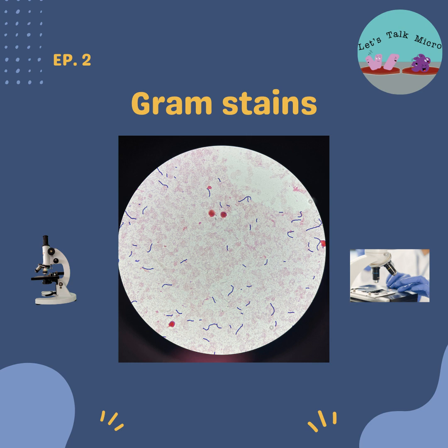And of course, as we continue making more episodes and talking more about micro, I will continue to talk about agar. But now let's go to this week's episode, gram stains. At this point in time, we all know our agar. Plenty of good resources out there where you can review the types of agar. Plenty of textbooks, the internet. So now let's talk about gram stains.